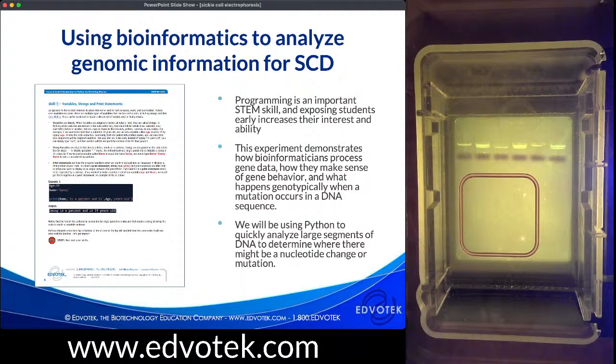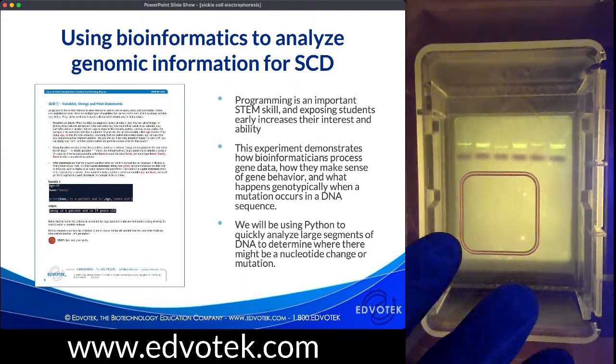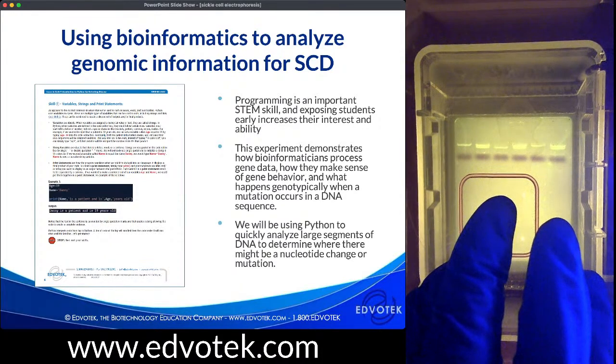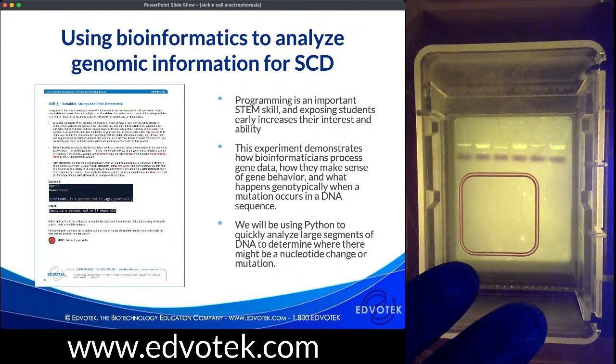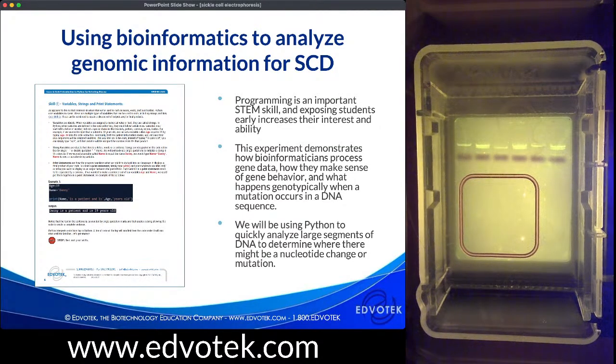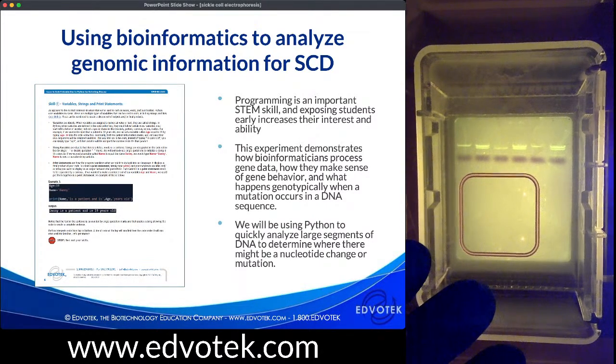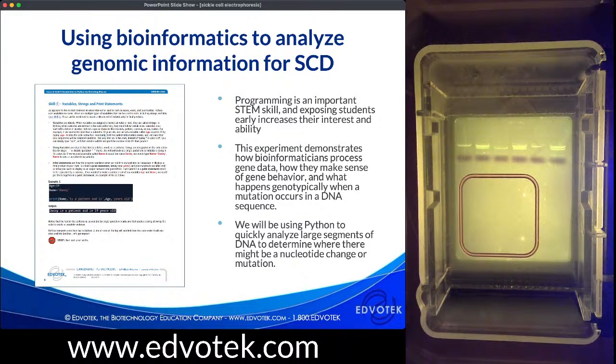for that. With the dye electrophoresis experiment, we have lots of different colors, right? And the EDGE has an orange filter. That is going to affect the way you can visualize some of those bands when the experiment is being performed. The beauty of the dye electrophoresis experiments is you can watch the DNA as it's separating through, and you can watch the dyes as they separate through. Throwing the orange filter on and having the blue light does affect the way those experiments are run. It's not to say we can't do dye electrophoresis experiments in the EDGE, and it's not to say the DNA experiments you're already doing need to be done in the EDGE.